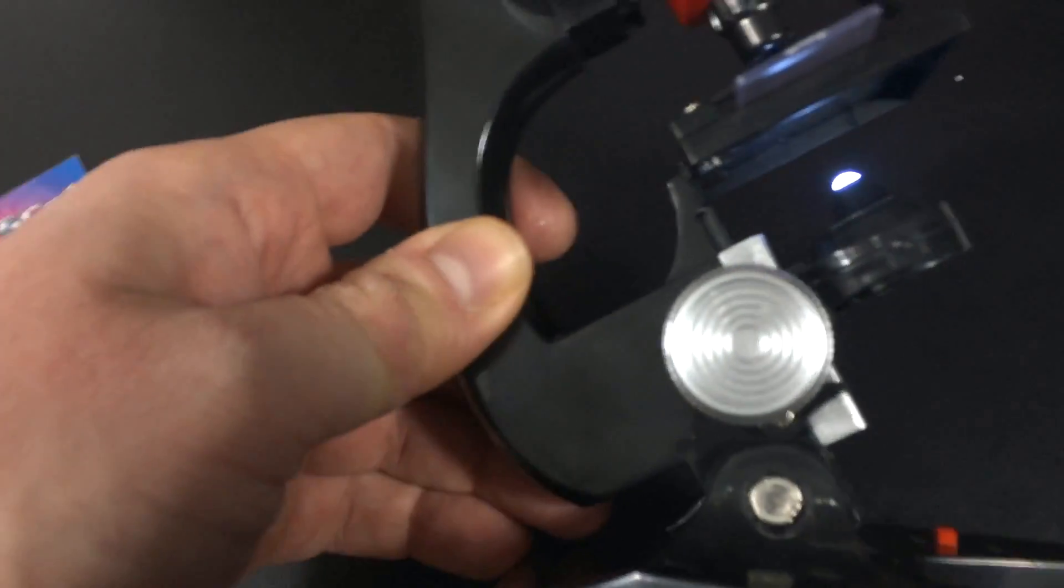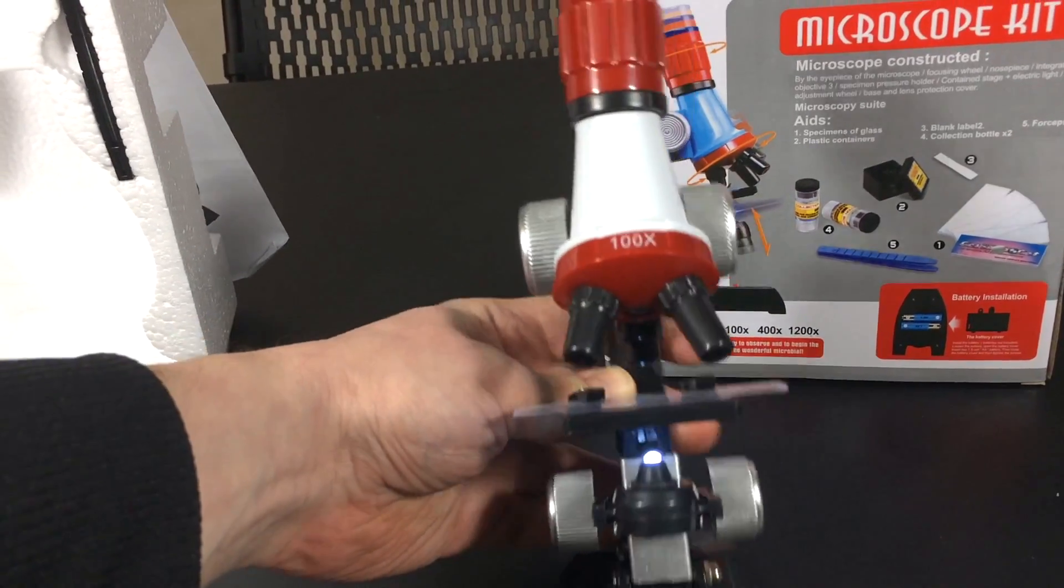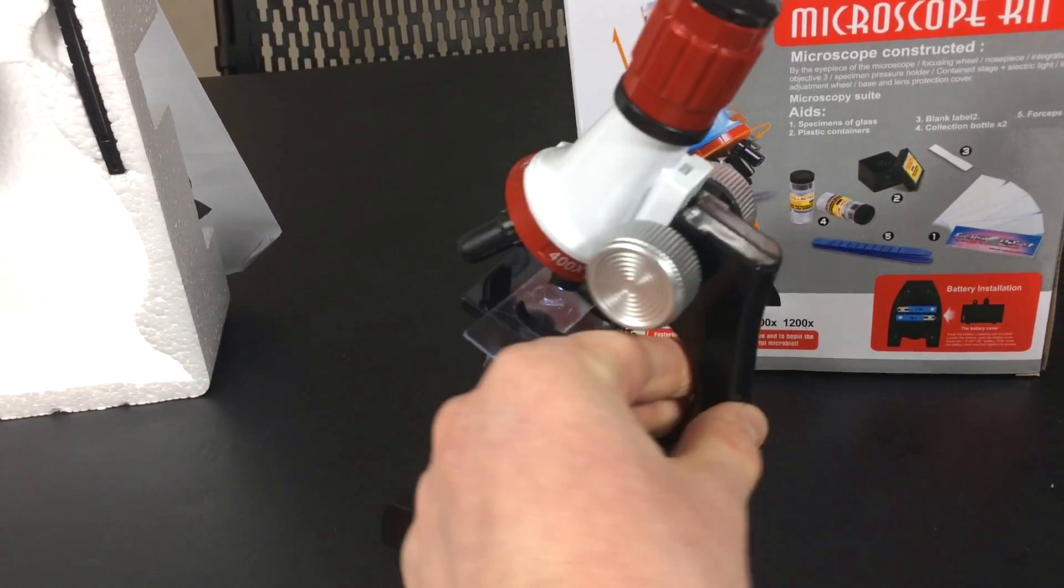You are still able to see a very small piece of material very up close. You could also experiment with a bunch of other things. I haven't prepared any more slides, but if you guys are interested to see whether I have the abilities and know how to prepare some other slides with this cheap little kid's microscope, for basically five or six bucks that you can pick it up. This is the cheapest you can get. Let me know down in the comments. And not a bad deal overall, right?